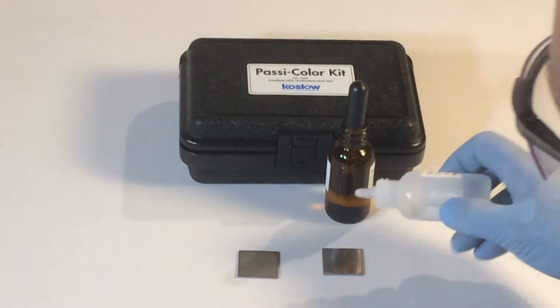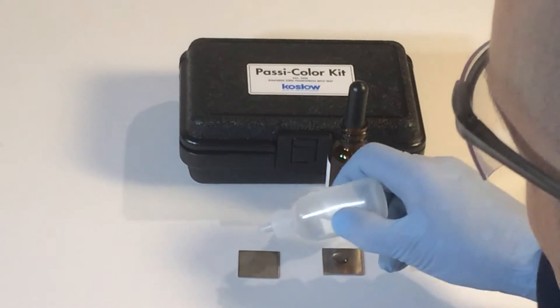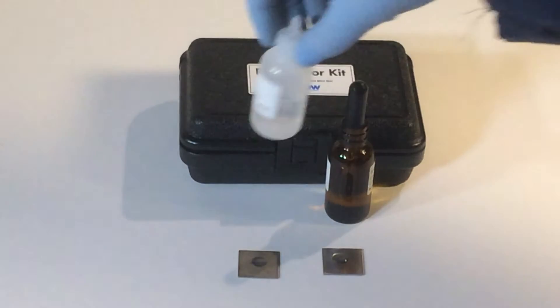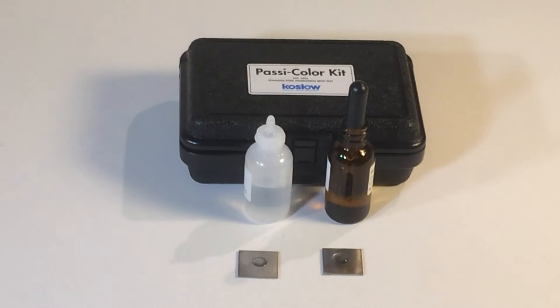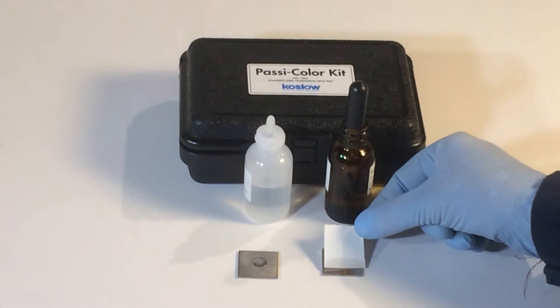The first step to evaluate these two samples of stainless steel 304 — we put on a couple drops of solution, and then wait for about one minute. After one minute, use your test paper and dab up the drop.